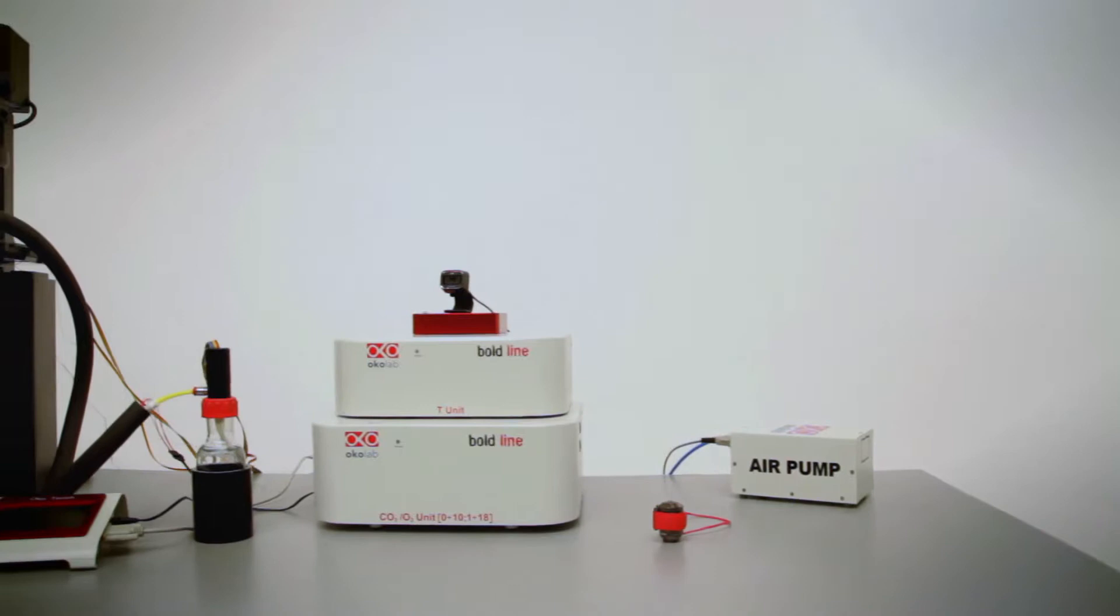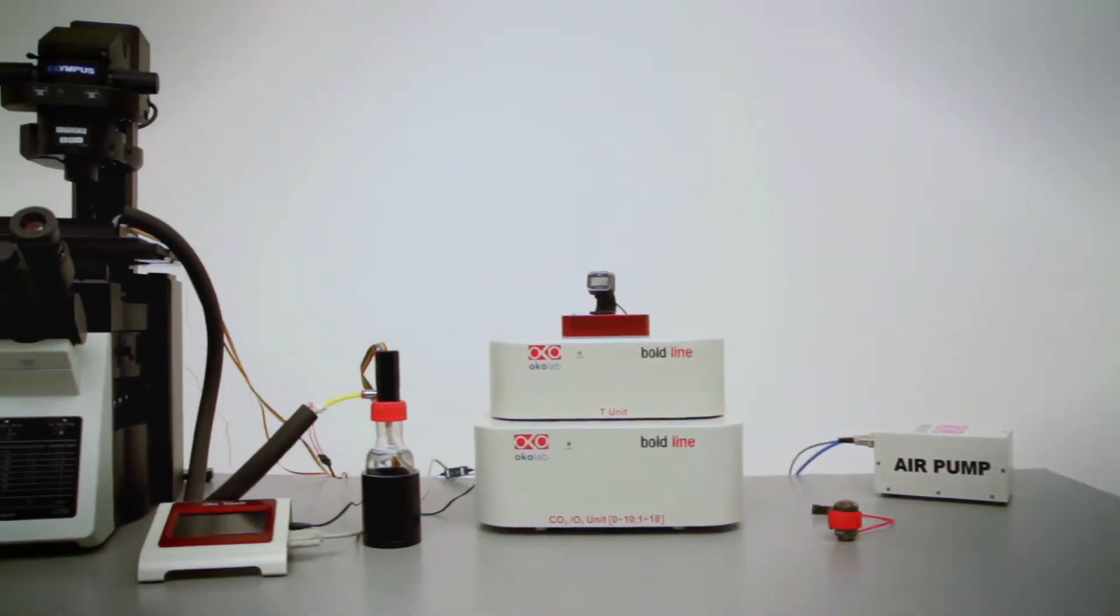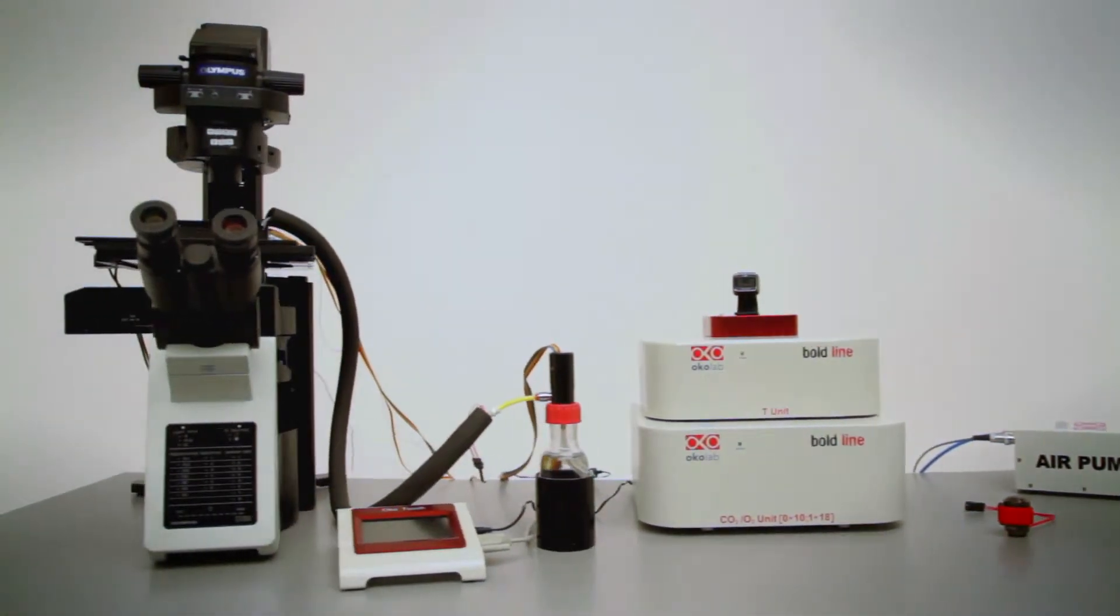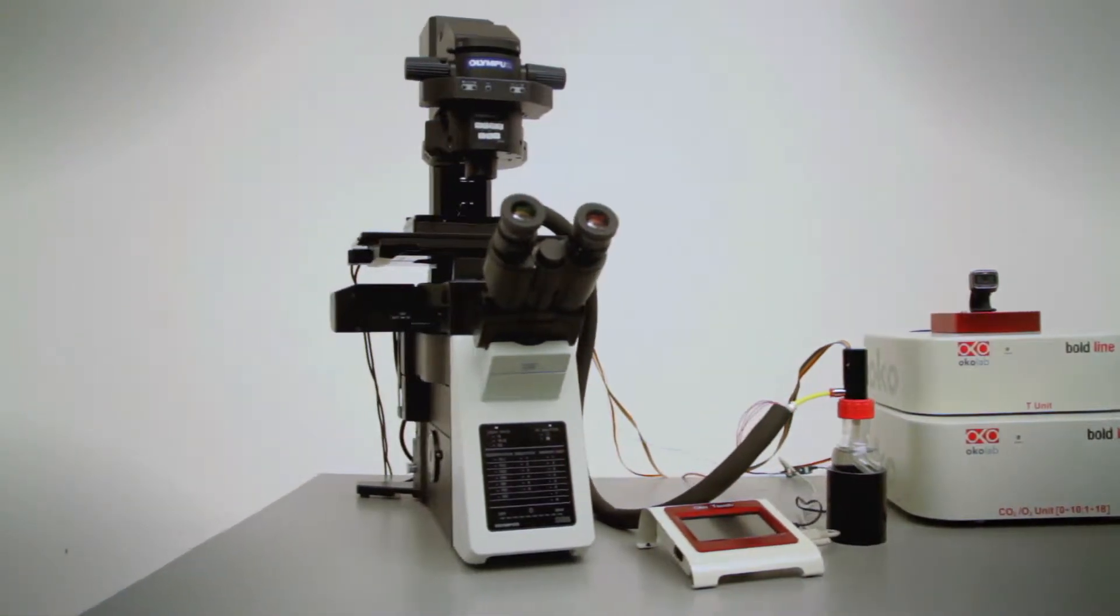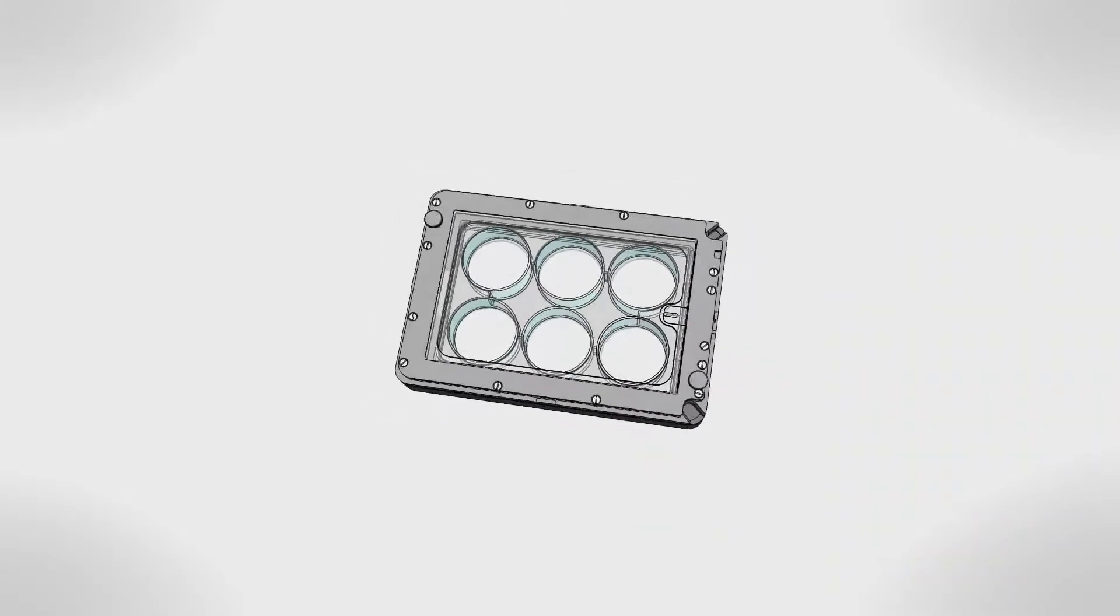The Boldline Top Stage Incubator creates a small environment right on the microscope stage with superior control of temperature, humidity, carbon dioxide and oxygen concentration.